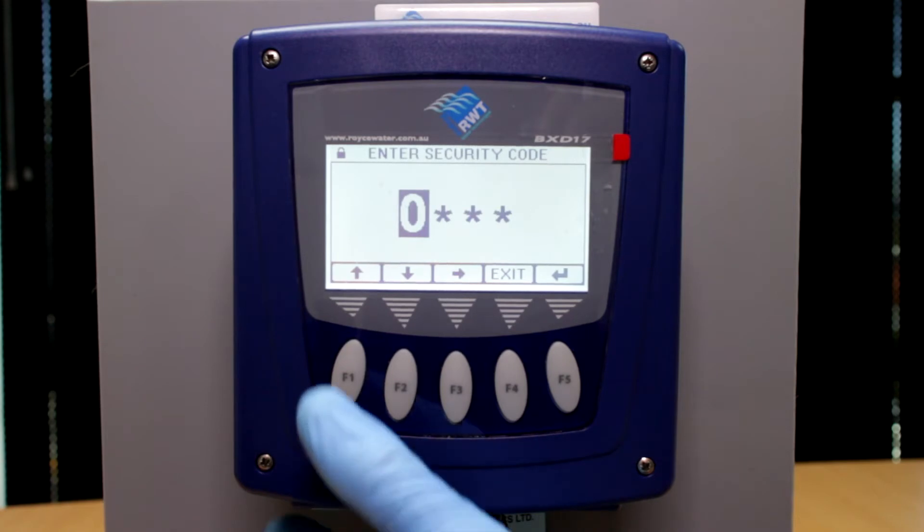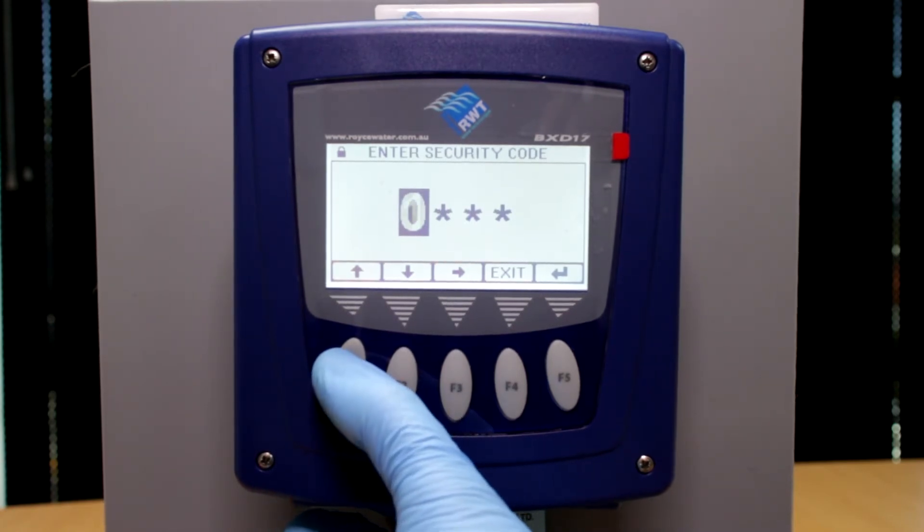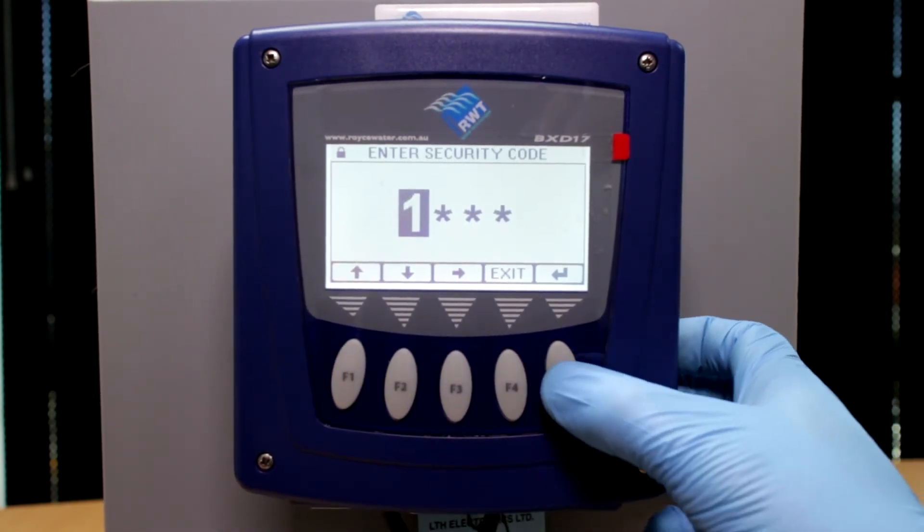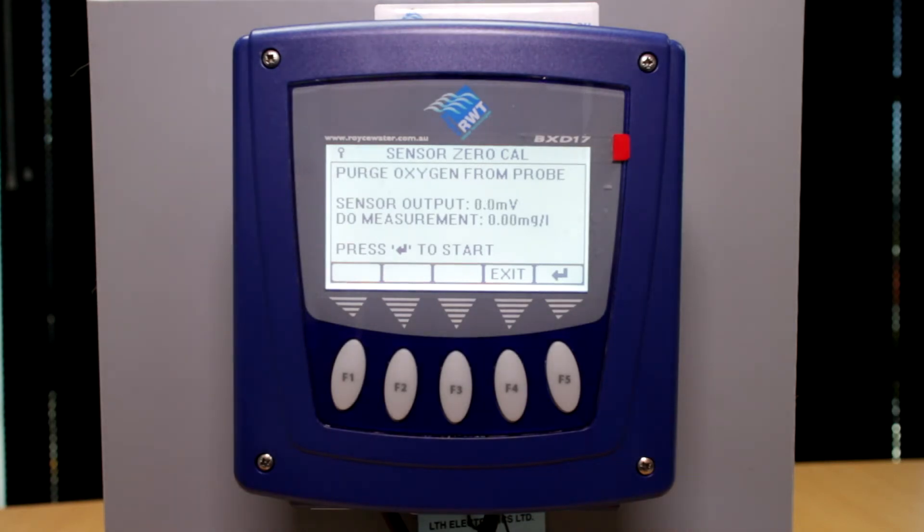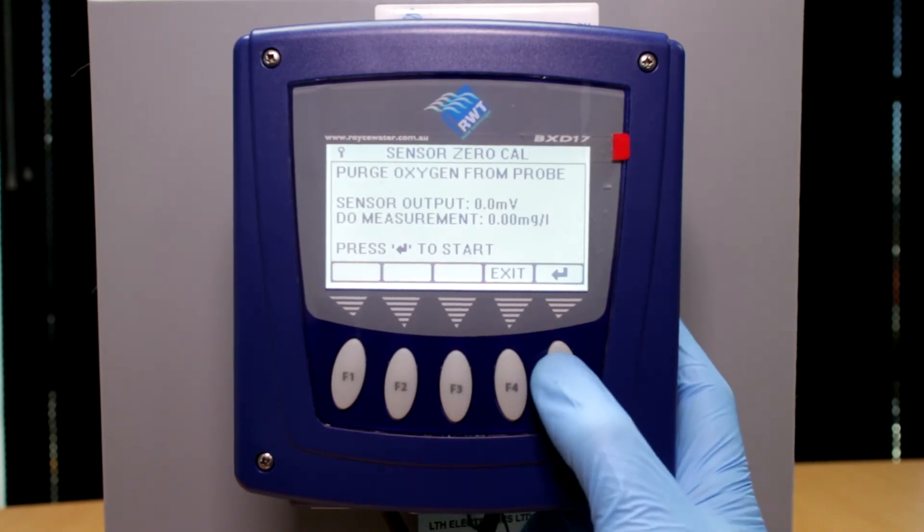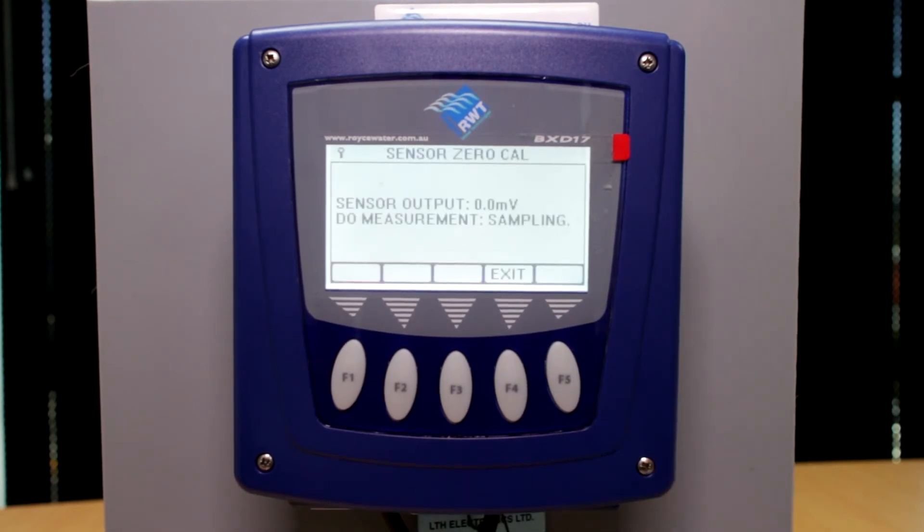The security code is 1. Push F1 until 1 appears, push enter. Instructions are to purge oxygen from the probe - this means to place the probe into the zero DO solution or RAS or WAS. You'll notice the millivolt signal should start to drop. Your DO probe should hit 0.0 millivolts or very close to. Once this happens, push F5 to start the calibration process. The BXD is now sampling the zero DO condition.